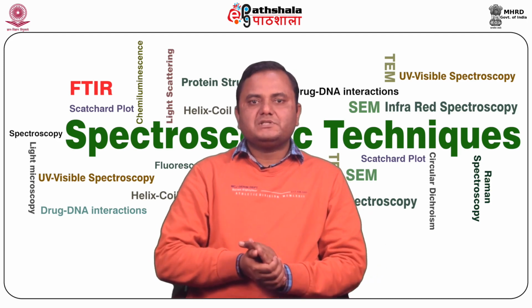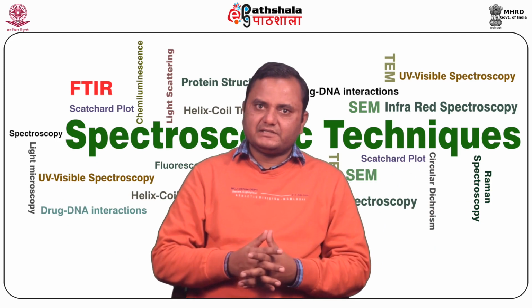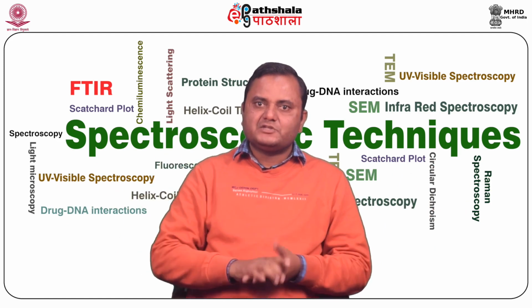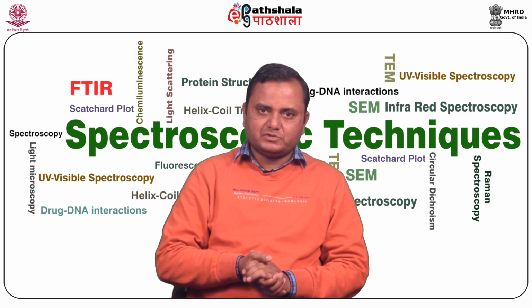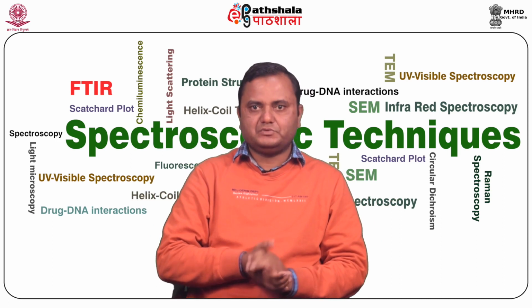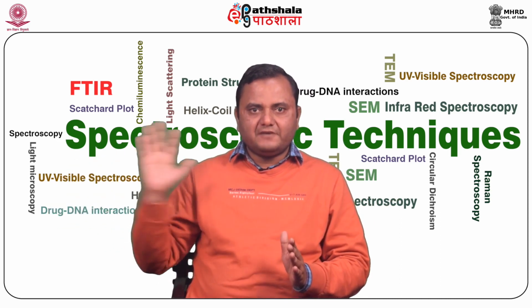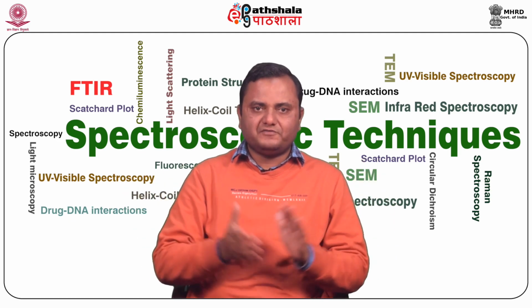Now we discuss the most important part of fluorescence spectroscopy: whatever output you get is in the form of a fluorescence spectrum. So how do we analyze or interpret fluorescence spectra? Keep some rules in mind. All fluorescence of a protein is due to tryptophan, tyrosine, and phenylalanine, unless it contains some extrinsic fluorophore or cofactor.